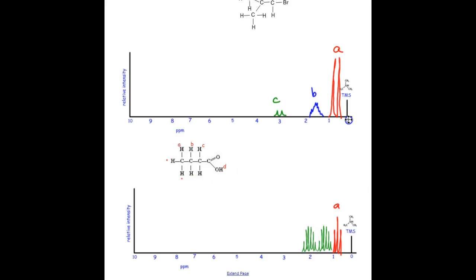And again, these are sketches. Because these are so much bigger than they would be in real life, they're going to run into each other. And then the last one is somewhere between 10 and 13. And it's not split at all. I didn't even make my scale long enough, so it's going to be somewhere around here. So that's a sketch for that one.